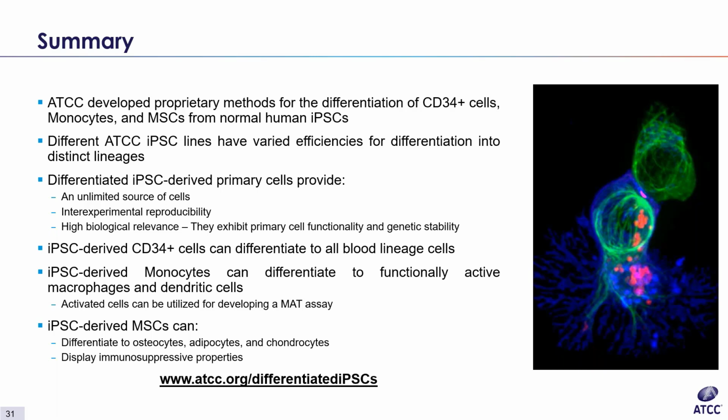All right, and the questions keep rolling in. The differentiation of iPSCs to CD34 positive cells is not completely homogeneous, since at least 20% does not express the CD45 molecule. Why is this? I like this question. This is interesting.